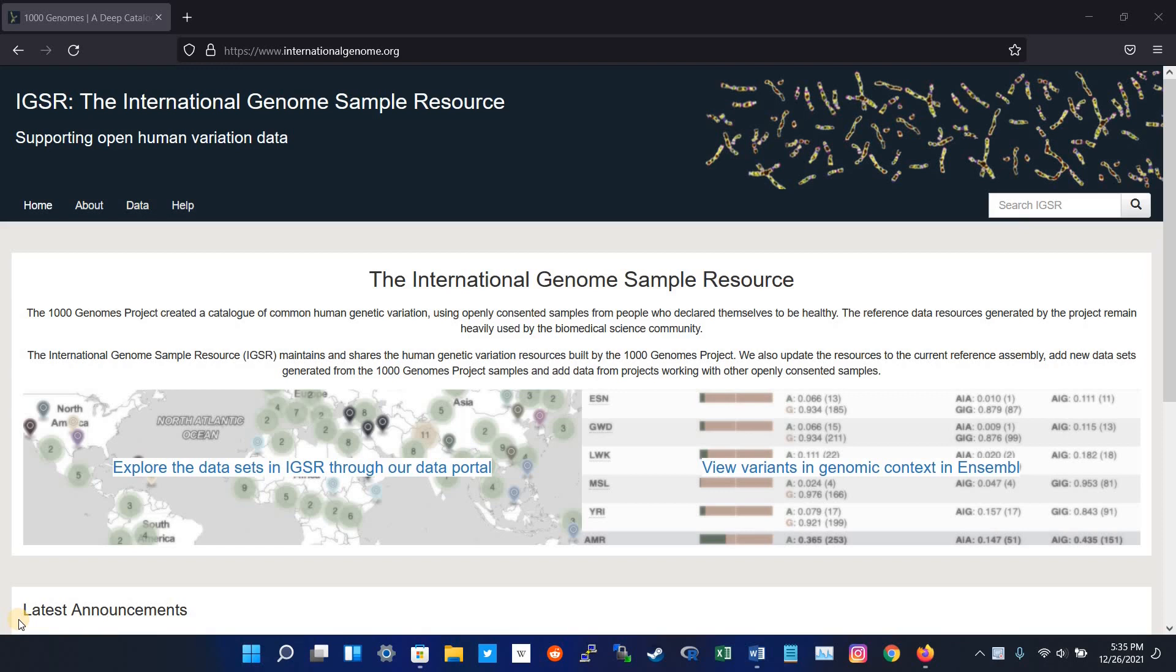The Thousand Genome Project launched in 2008. It is the most detailed catalog of human genetic variations. The goal of the Thousand Genome Project was to find common genetic variants with frequency in their studied population.